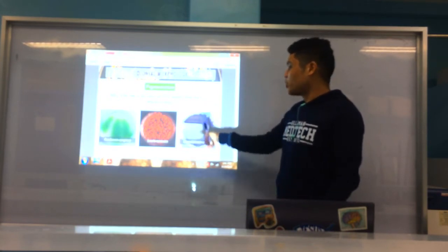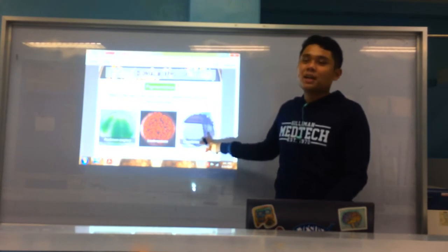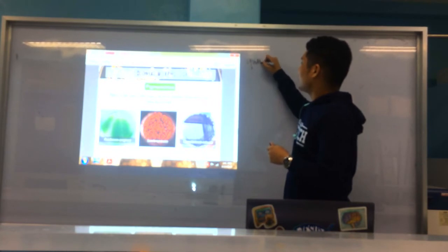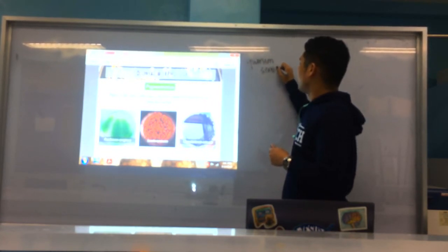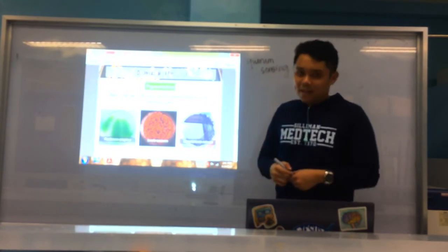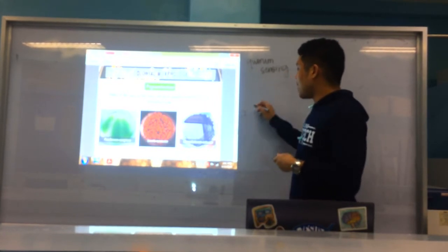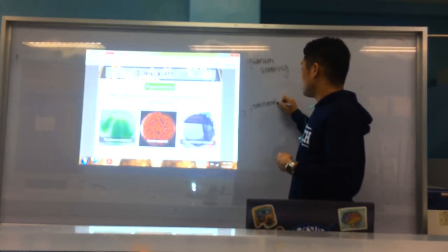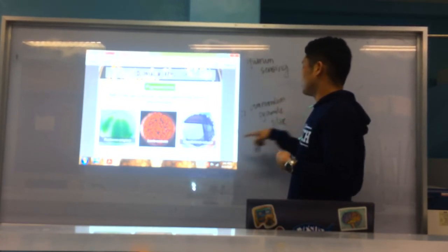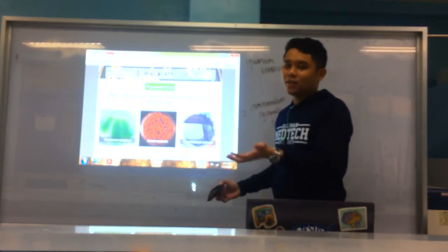And last one is, of course, Chromobacterium violaceum. By the name itself, violet. This is also your standard for quorum sensing, which you remember from intro to micro. Chromobacterium violaceum releases a violet-colored pigment in colonies. In case studies, violet-colored colonies with an ammonium cyanide odor, press the buzzer: Chromobacterium violaceum. No need to think about the color of its colonies, it's violet, it's in the name.